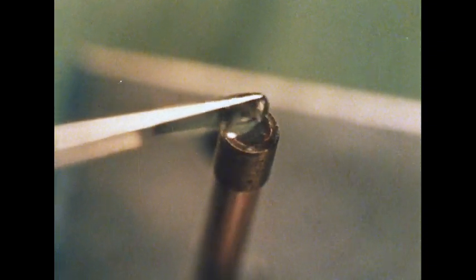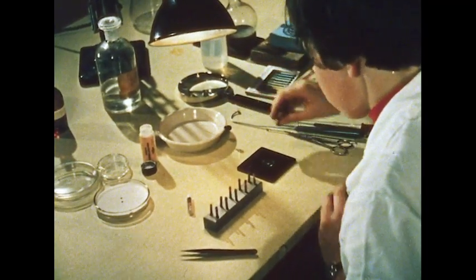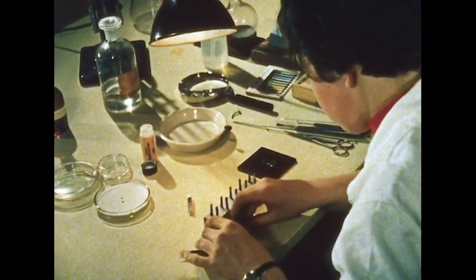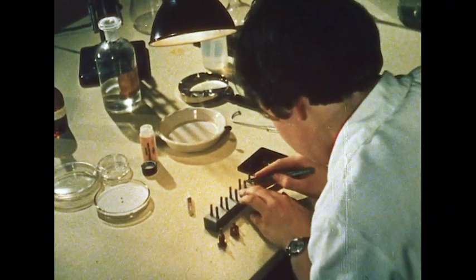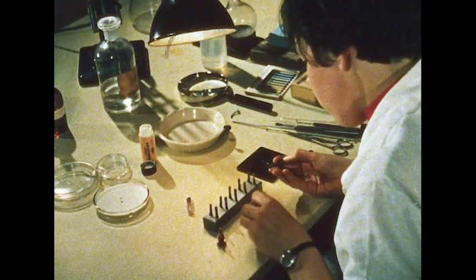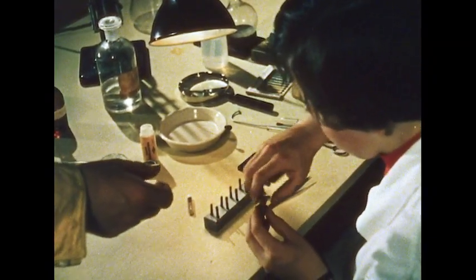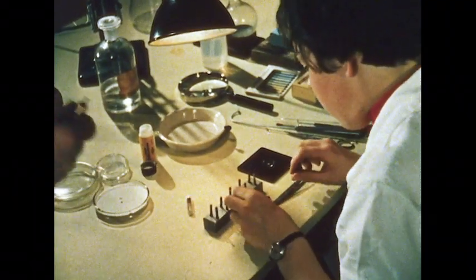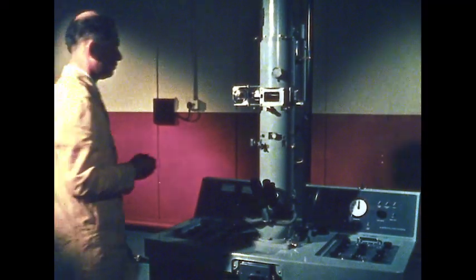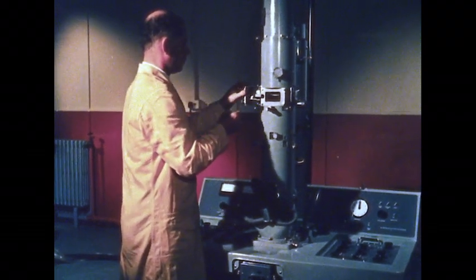A suspension of latex rubber is being examined. The rubber is supported by the carbon layer. Preparing specimens for the electron microscope is a painstaking job because everything is so minute. The next step is to put the holder into the specimen chamber, close the airlock, and pump it out.